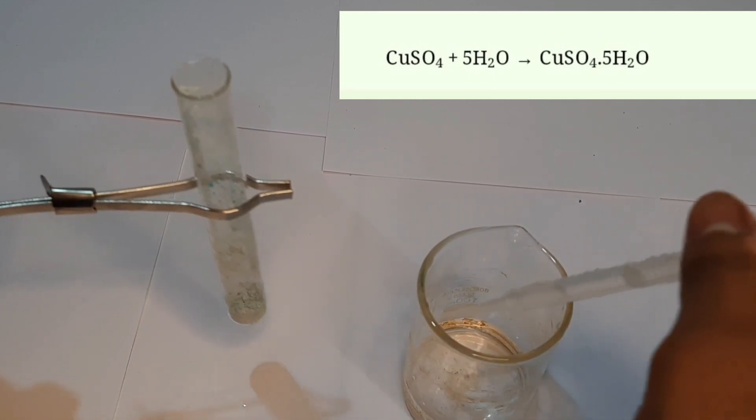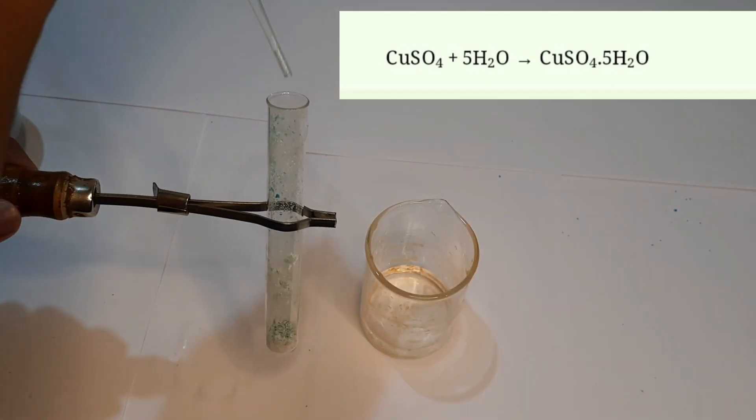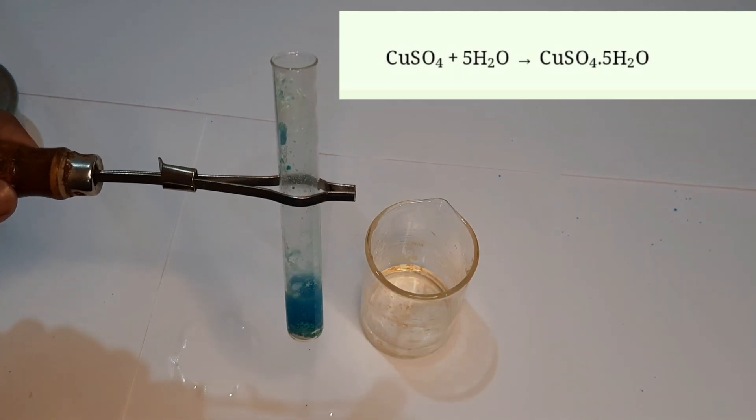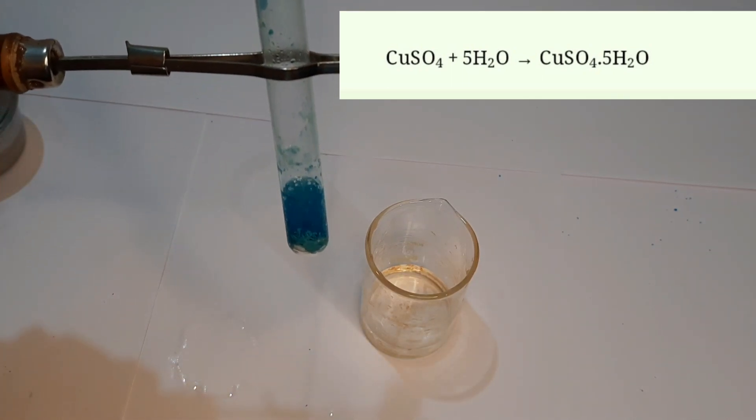The dehydration of copper sulfate crystals is a reversible process. When water is added to anhydrous copper sulfate, it gets hydrated and turns blue due to the formation of hydrated copper sulfate.